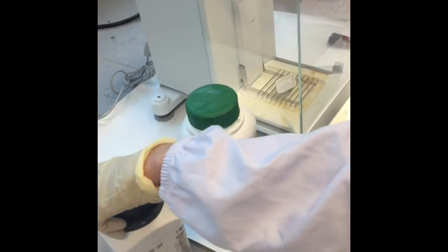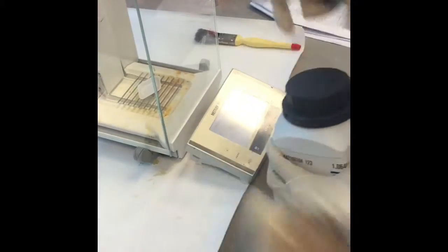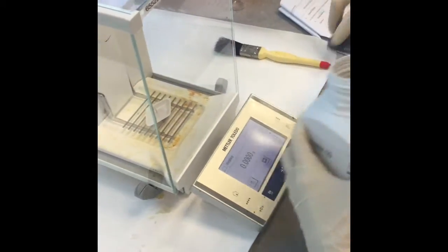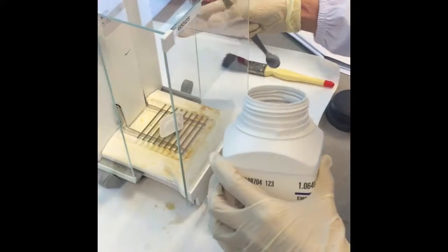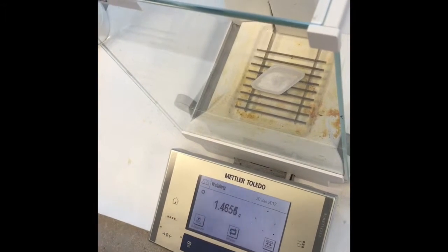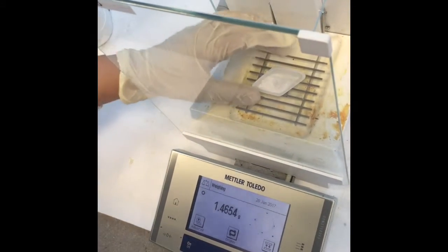So here Andrea is with me today, and she will help me to measure the correct amount of sodium chloride. Before you proceed, please ensure that the weighing balance is tared and sweep any residues left at the top of the pan here. The amount that we're going to measure today is 1.46 grams. After measuring sodium chloride, please label the weighing boat to avoid any confusion, and do so for every measurement that you are doing.